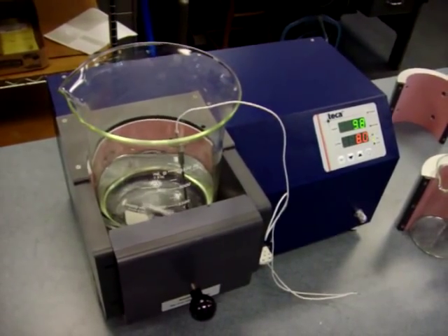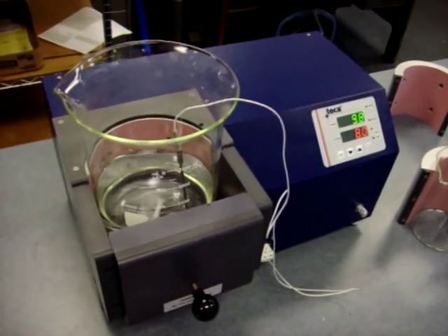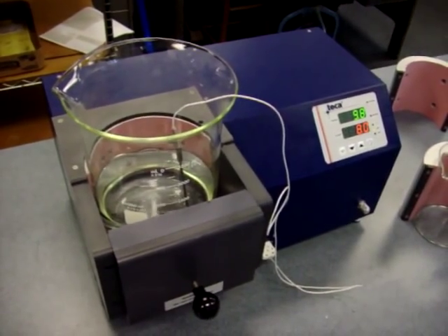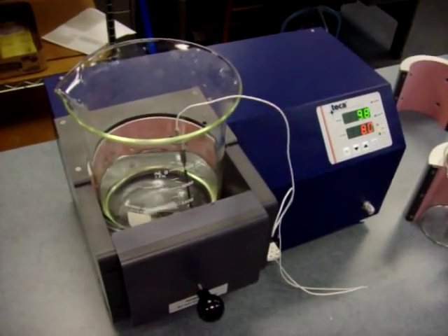We have some online typical tests that run from 4°C to 40°C just to see how fast and how well the unit controls. So it does heating and cooling? Heating and cooling, yes.